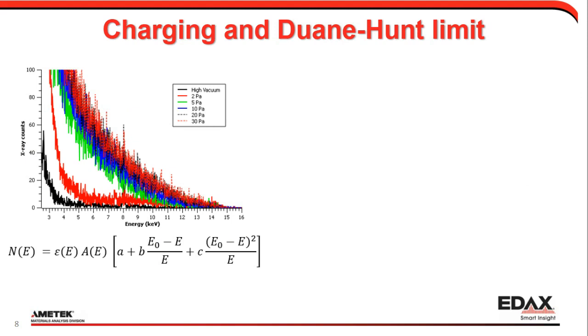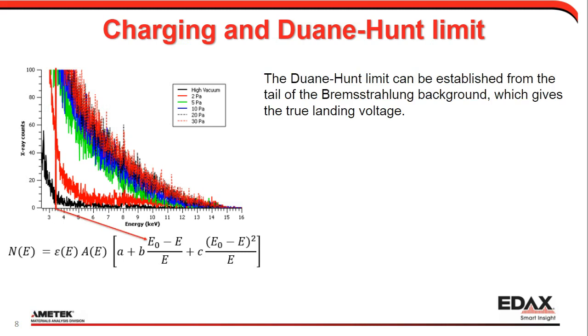Basically, I just look at the spectrum here. Let me animate. So we can see each of them has a drop-off where it goes close to 0. When you zoom it out, you can see it has a tail that goes down. And this is a rough estimate. I just take the black line here and see where that tail roughly tends down towards 0 counts.